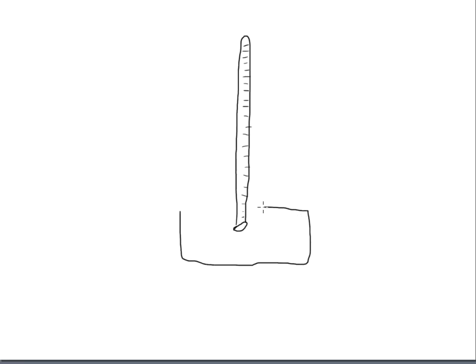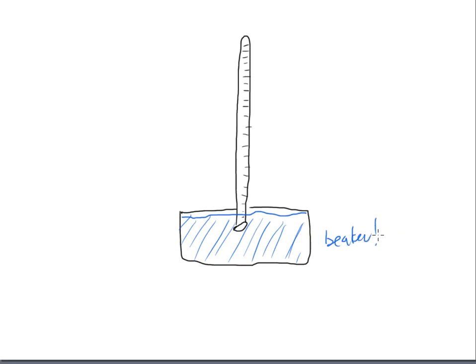All right, that's what this is. And I'll take just simple deionized water. That's it, nothing more. I'm going to put deionized water into this bowl. Fill it almost full, not quite. If you don't want a bowl, and if there's not one convenient, a beaker will work. So just a very large beaker works great for this process. Fill it full of water and just have it ready for your eudiometer when you get that prepped.